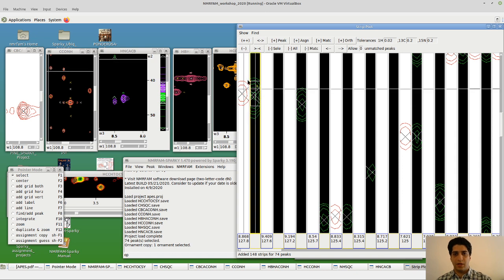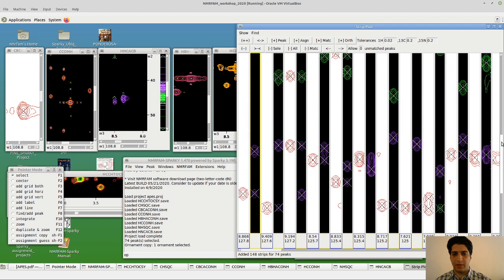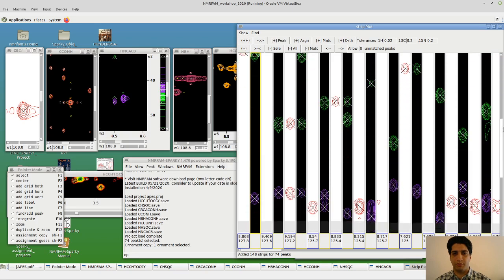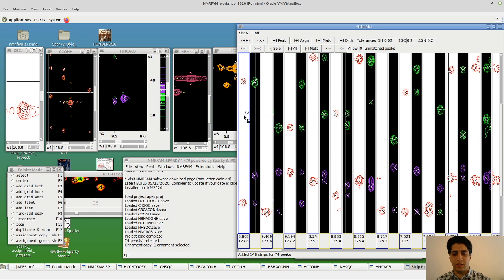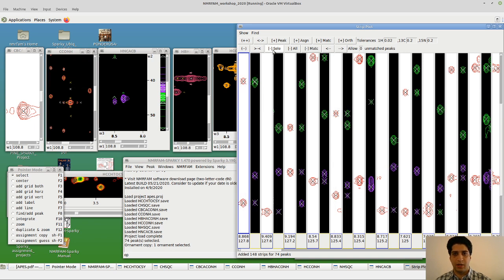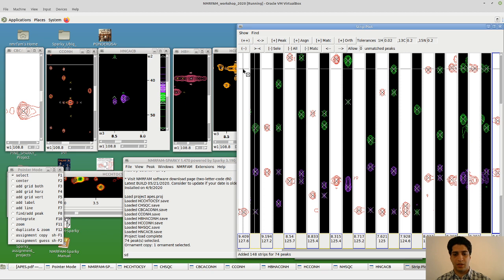What we did was we selected this one, pressed OC, copy, and we went there, pressed OP, and we created a peak that was missing because it was a shoulder peak. And now if we go up and down, we can see that we have 2 peaks and 4 peaks. So this pair is fine. We're done here. We can just delete them by using either this button or the 2-letter code SD. SD, another SD, and it's done.